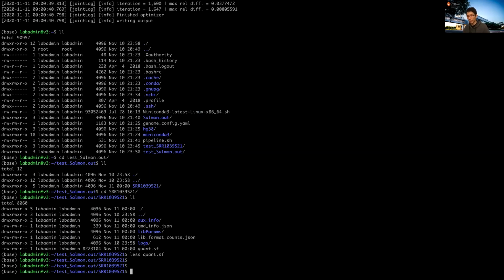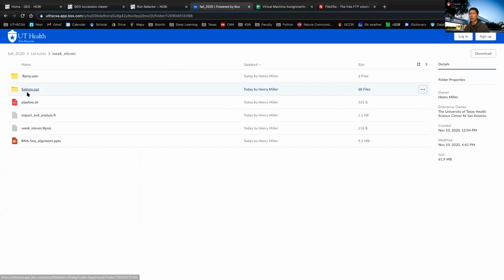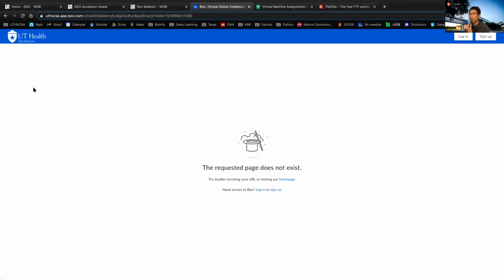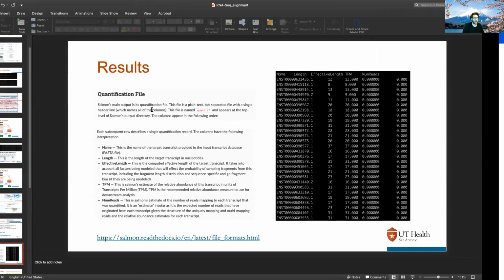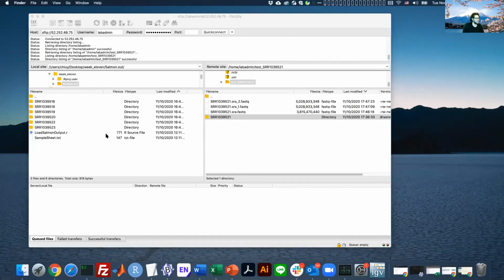So you guys can keep this running if it's not done yet. But from the box folder, I think you already have the six samples done, I mean the Salmon outputs of 6 samples. So from the Salmon out folder, Henry already did 6 of the samples. It's okay, it's in the chat. Okay, I already downloaded. So you can take a look at the chat. There's a link. So I already downloaded everything.